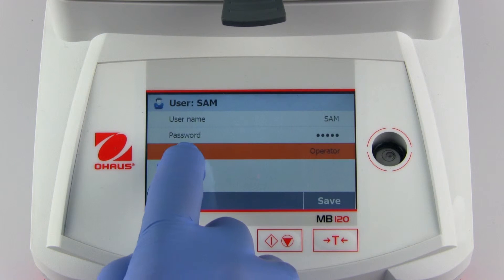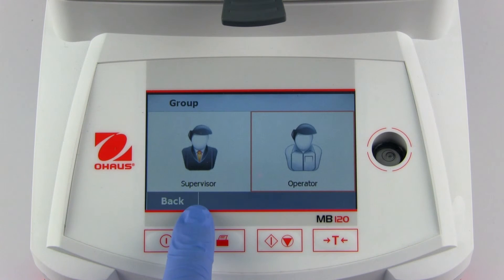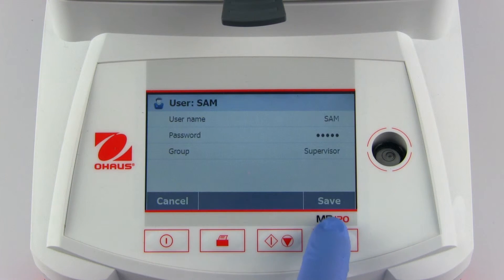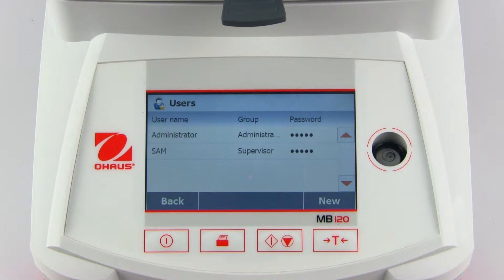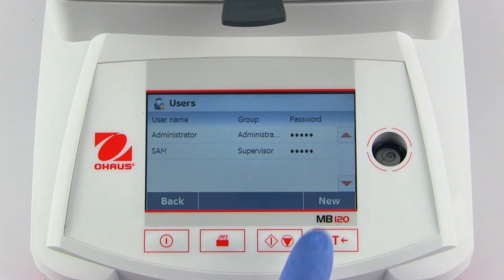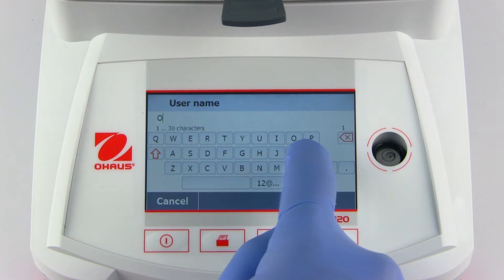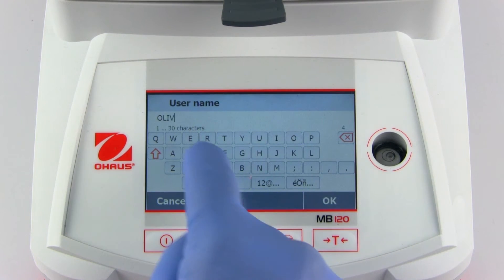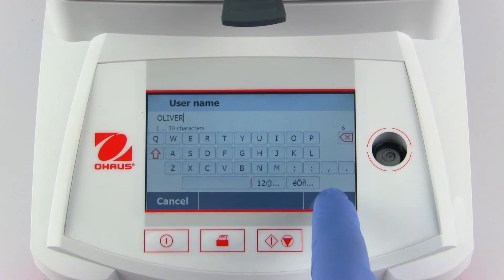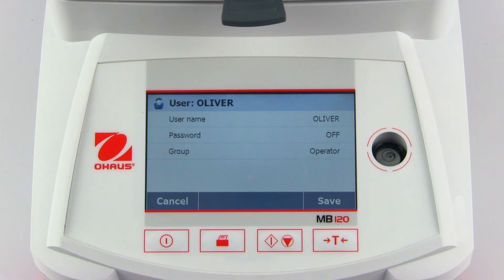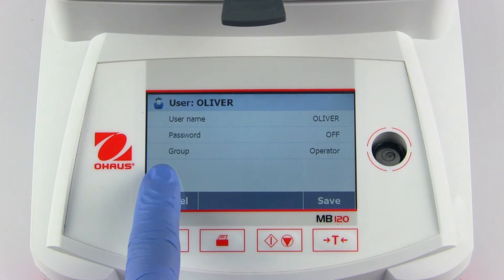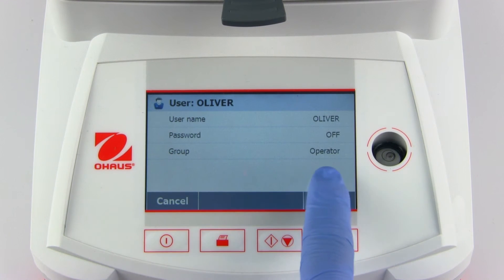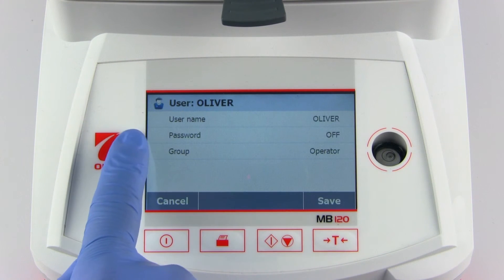Let's assign Sam to the supervisor group. To create an operator, select new and enter a user name.